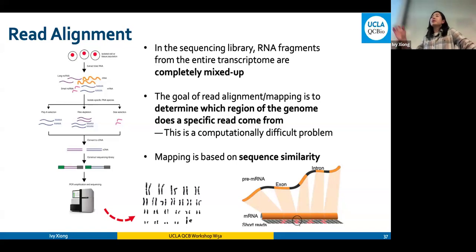Okay. You map it to the reference genome, but you want to find out where they are, right? That's where the annotation file comes in, and you will get to actually have both files. The original assembly, which is the reference genome itself, just raw sequences, and then the annotation files would actually mark specific regions in the reference genome to tell you, oh, this is this gene, and for this gene, we are looking at exon 1, 2, 3, or intron, or 5 prime, 3 prime UTR region. So the tallying step would actually make sure that we are counting the right region. Does it make sense? Yeah.